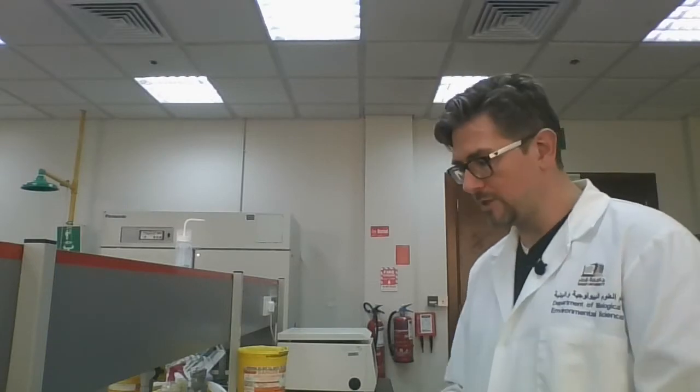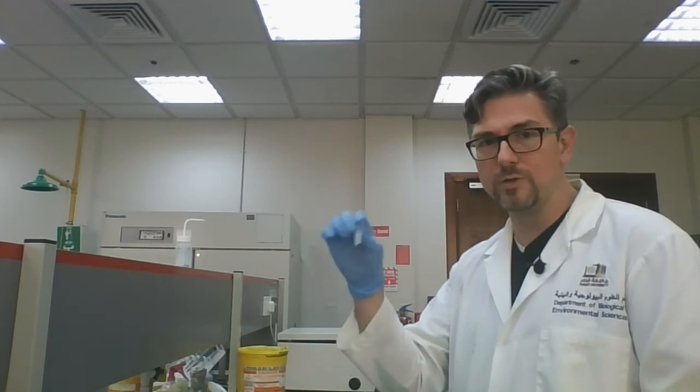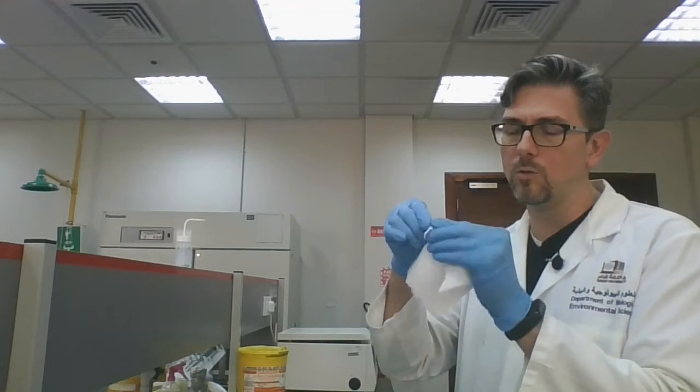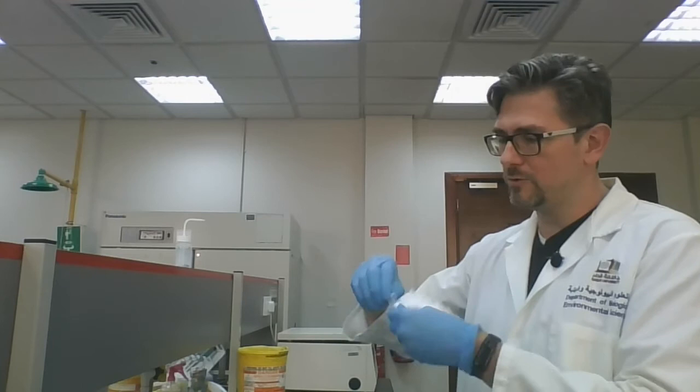Okay, so we're ready to put things in the centrifuge. Before you do that, though, please, please make sure that you don't have any ice on the outside of the tube. So just wipe them down with a paper towel just to remove any water and ice on the outside of the tubes before you put them into the centrifuge. So I'm going to do that. I'm going to spin our samples. And again, I'm going to balance our tubes.